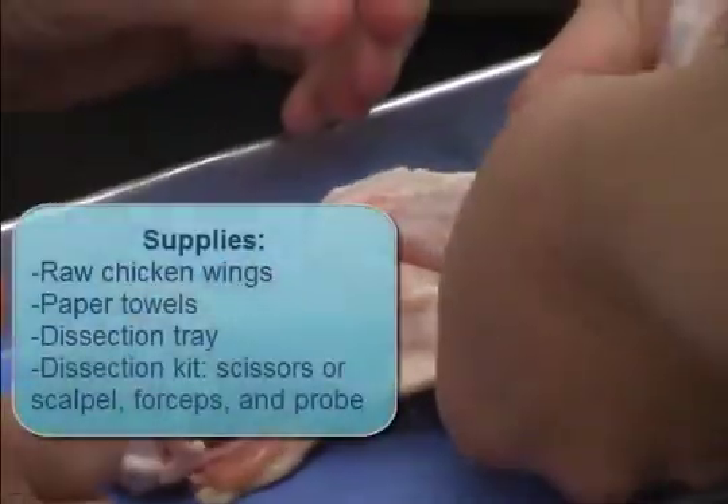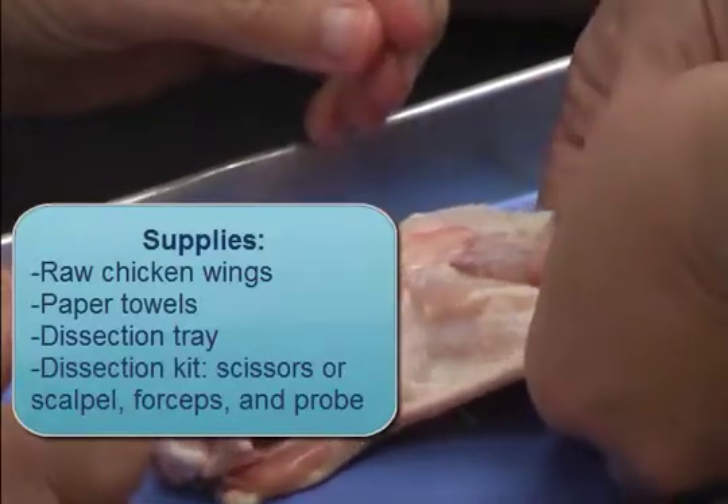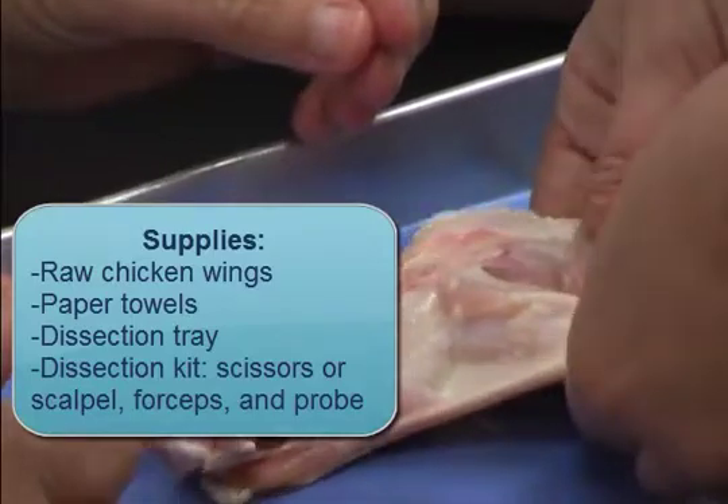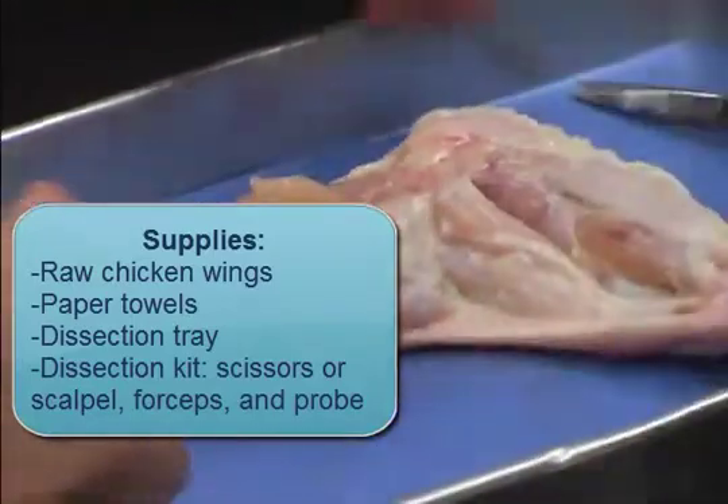The materials needed for this activity include raw chicken wings, paper towels, a dissection tray, a dissection kit made up of scissors or a scalpel, forceps, and a probe.